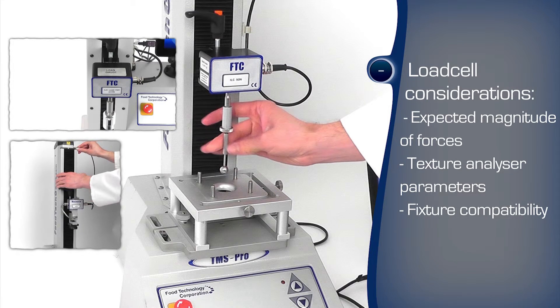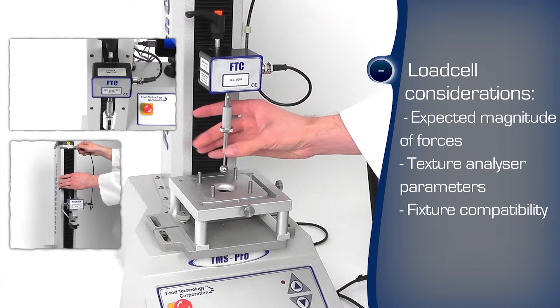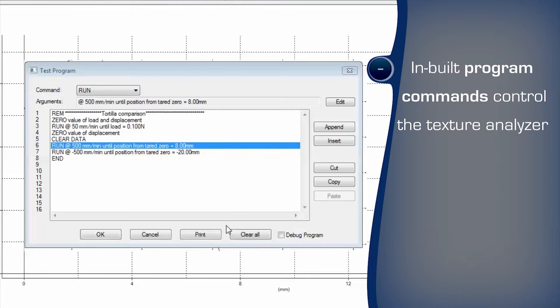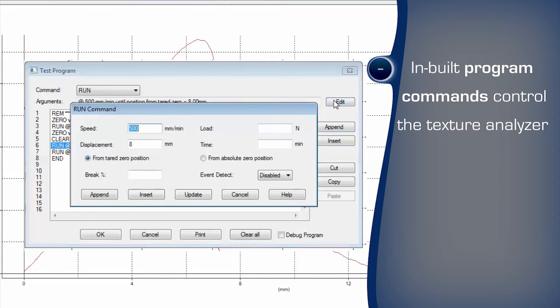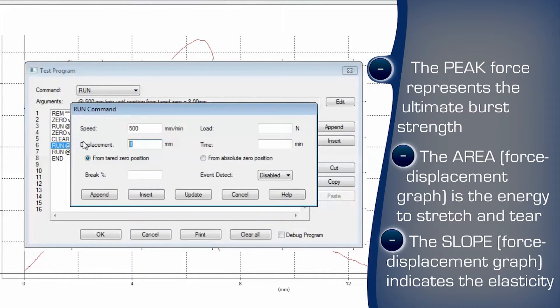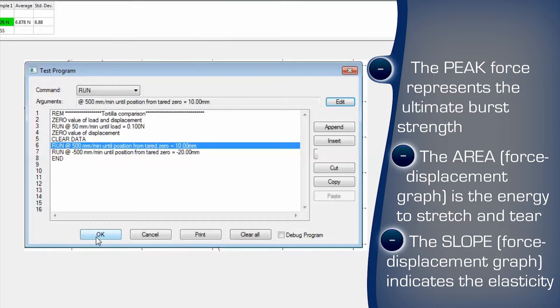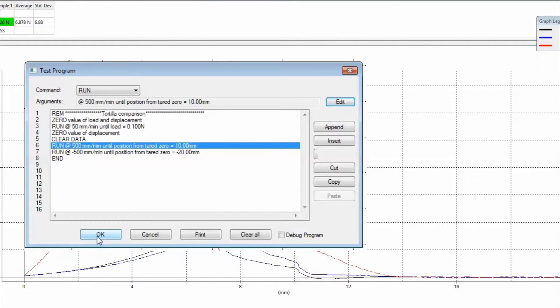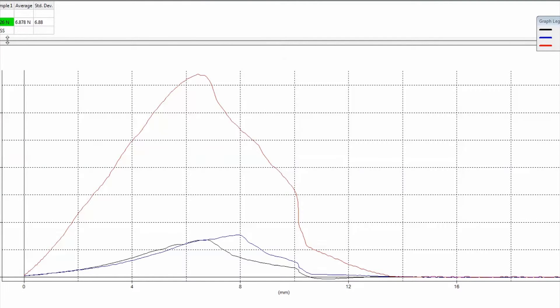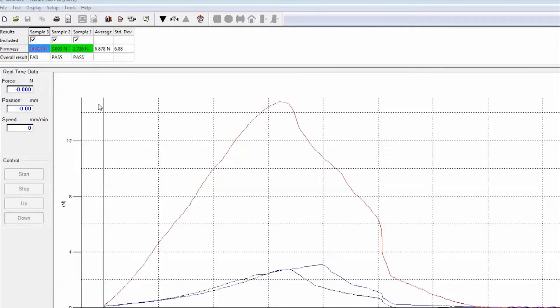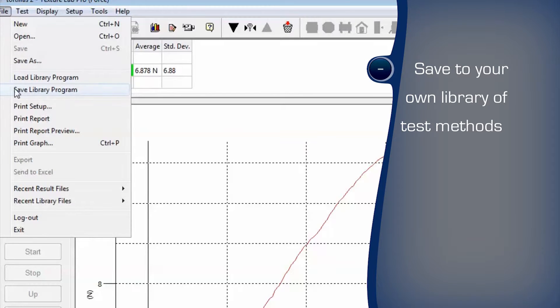A spherical probe is used to extend the sample to the point of tearing and penetration rather than to pierce. A suitably rated load cell is used to maximize measurement accuracy. The automated test program is easily written within the familiar Windows-based environment, with commands selected to perform the steps. The tortilla's ultimate burst strength is calculated from the peak force, and the displacement reached at the peak represents the extensibility. Work from under the resulting curve provides even more detailed information, and the program can be saved to a library and recalled for reuse.